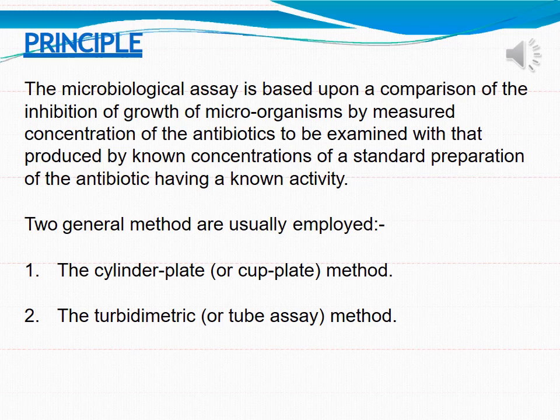activity. Okay. Now during this selection, it is very important that the concentration that you use for your antibiotic and the concentration that you will be using of the known antibiotic should be same, not almost, should be exactly same. That means you should be comparing both the antibiotics at the same concentration.